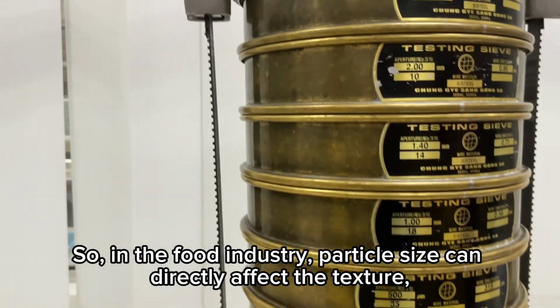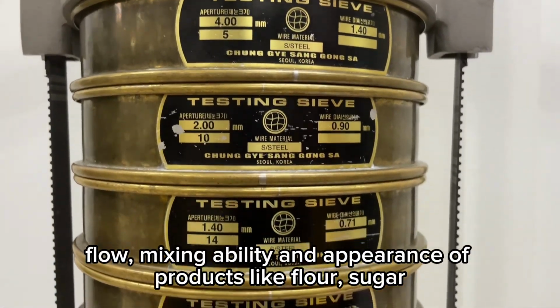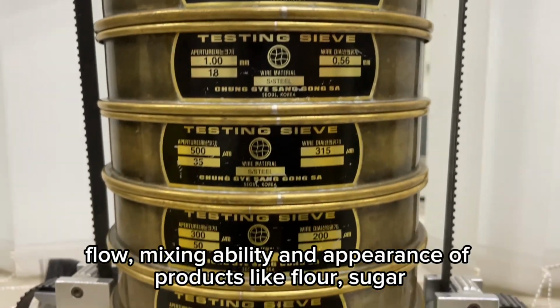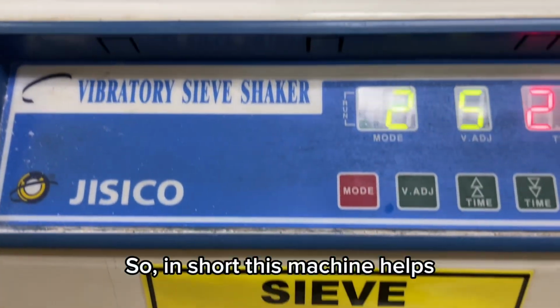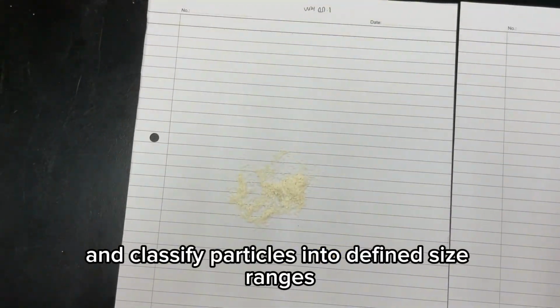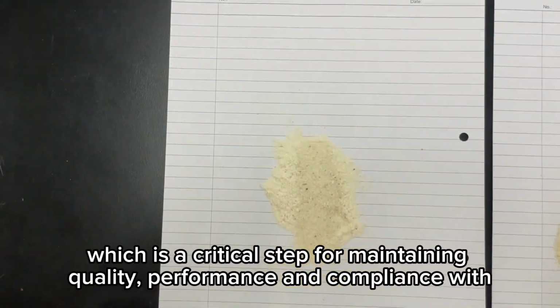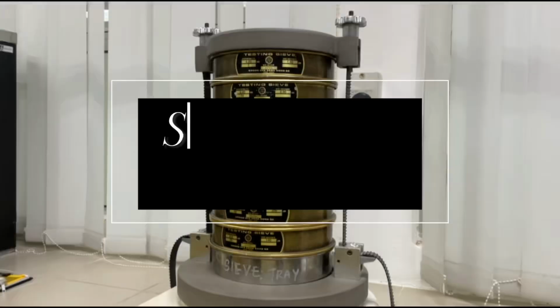So, in the food industry, particle size can directly affect the texture, flow, mixing ability, and appearance of products like flour, sugar, spices, or powdered milk. So in short, this machine helps separate, quantify, and classify particles into defined size ranges, which is a critical step for maintaining quality and compliance with food safety standards.